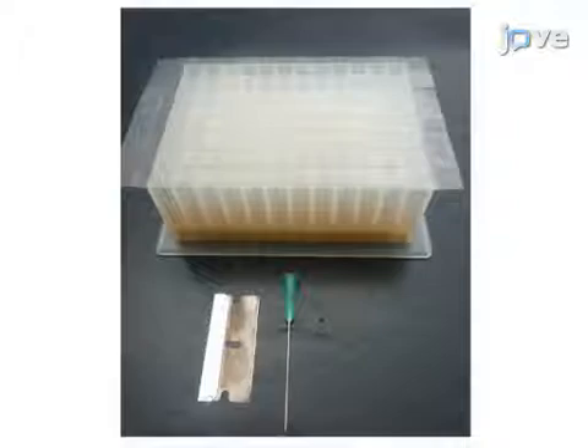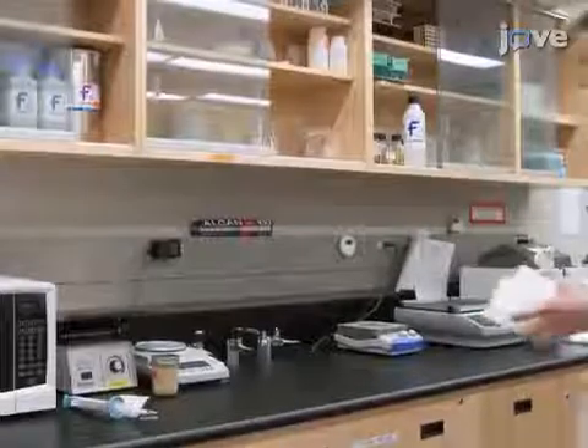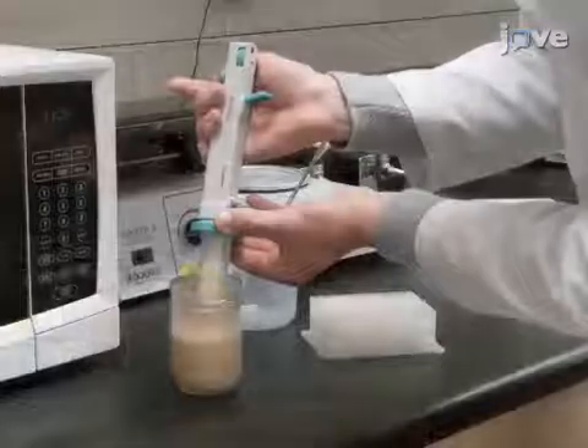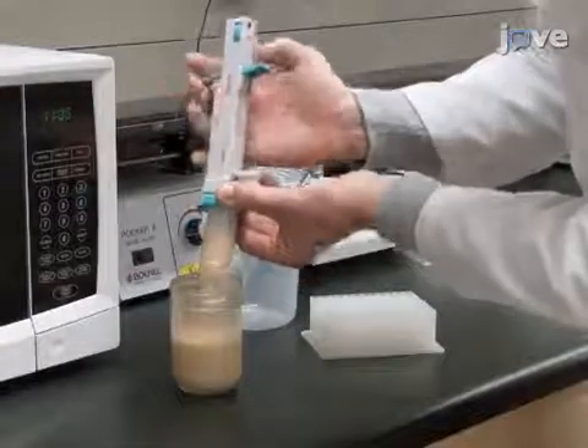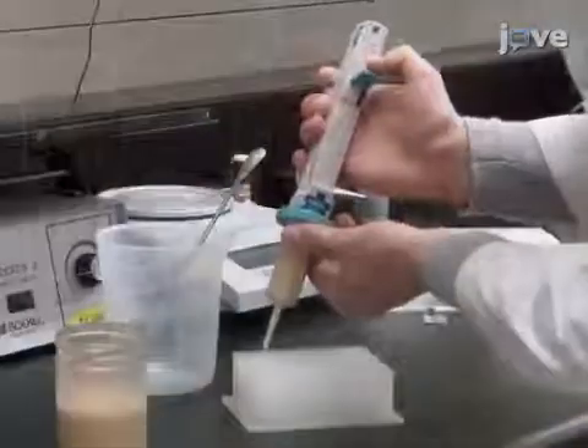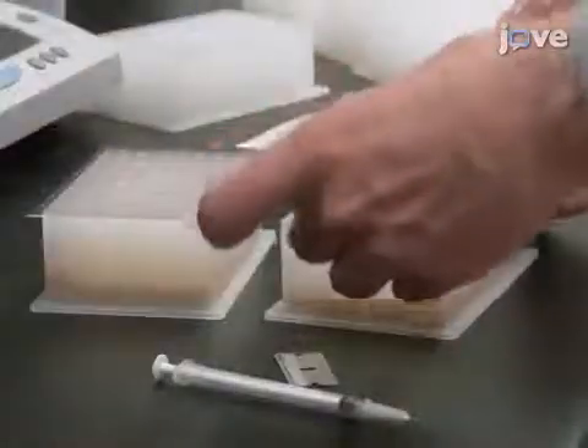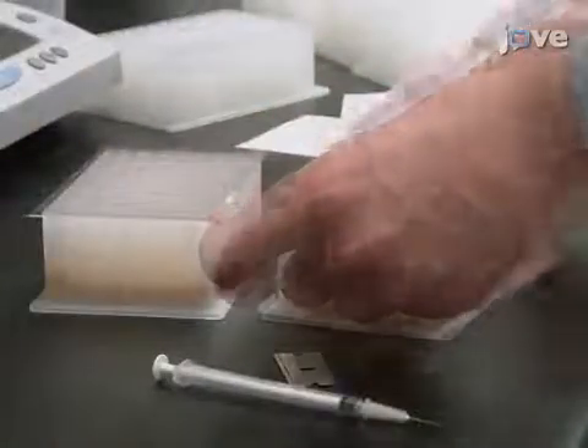This experiment introduces novel experimental housing blocks. Not more than two days before the experiment, prepare these blocks. Melt power food and add half a milliliter of it to each well of a 96-well flat bottom block using a repeater pipette. After the food solidifies, cover the block with PCR adhesive film.